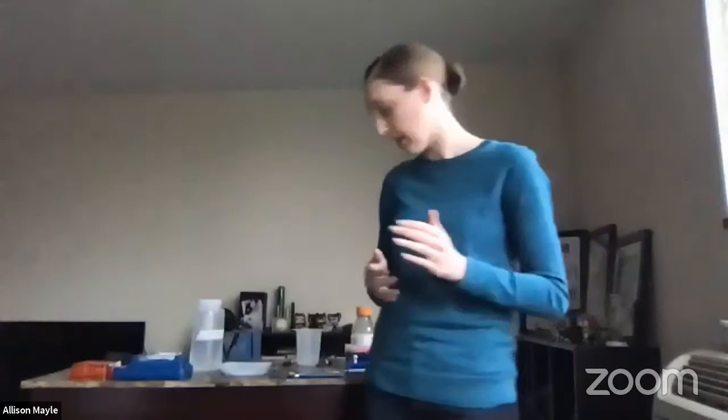All right, and those little pockets are where we're going to put our DNA. They're in the gel. We're going to put our DNA there. So I'm going to start sharing my screen again.